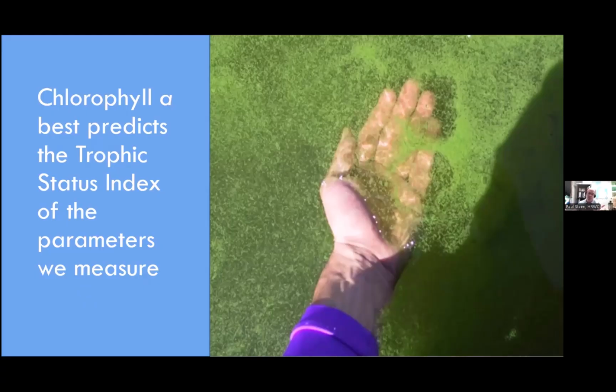It's great to do all three of those parameters. We don't want you to say just do chlorophyll, because I think one of the main reasons is because there are places in the chlorophyll measurements where you can make mistakes. And so we still want you to get Secchi and we still want you to get phosphorus in case something bad goes with your chlorophyll measurements. And plus those two measurements are very easy and quick. So you should always continue to do those as well as chlorophyll.